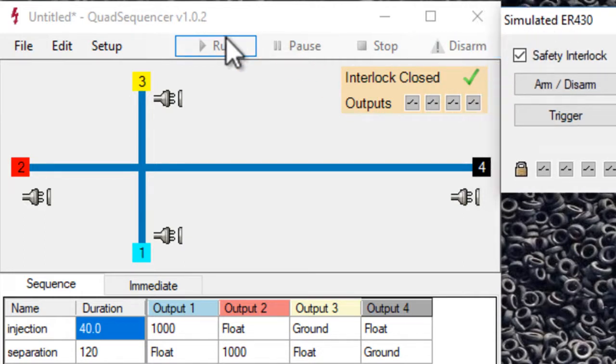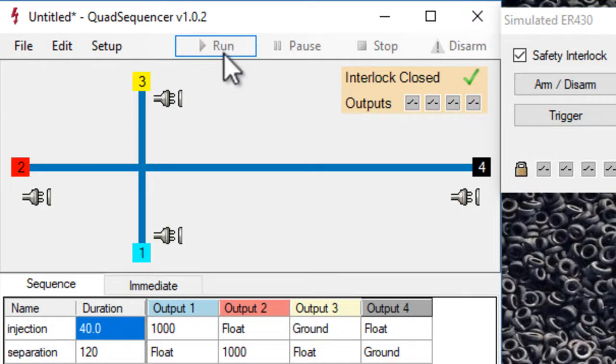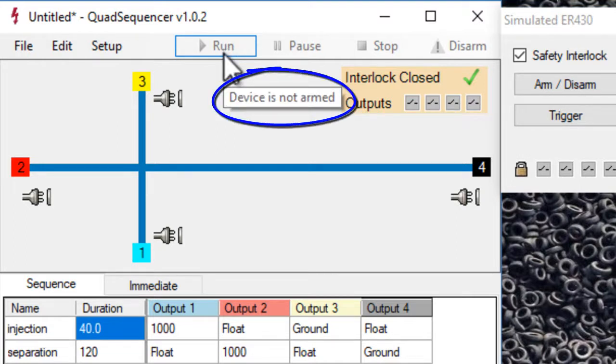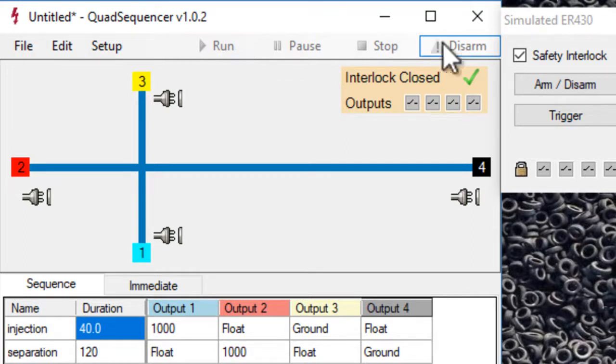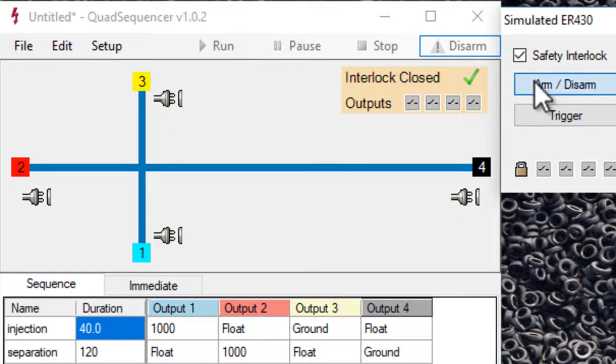If we try to run now, it's going to tell us that the device is not armed. So this is the red button on the front of the high voltage sequencer, which you need to press. You can click here to arm. So we're now ready to run.